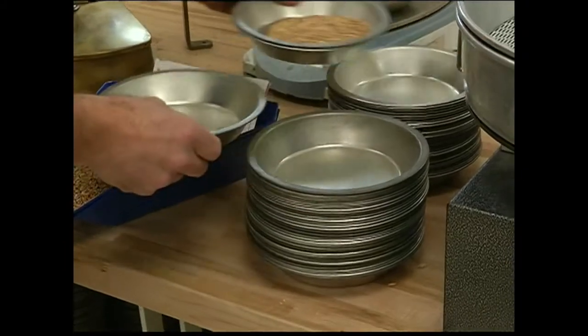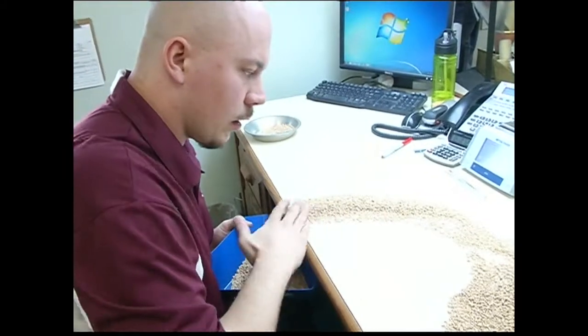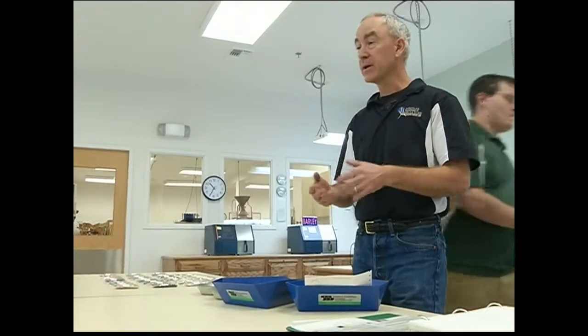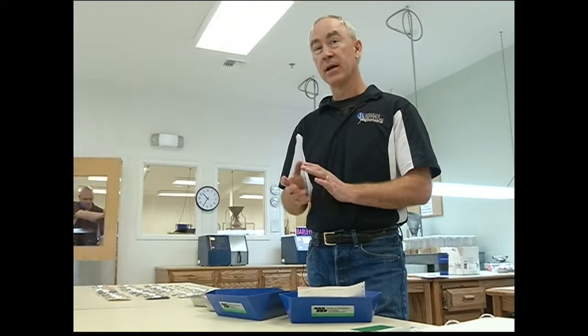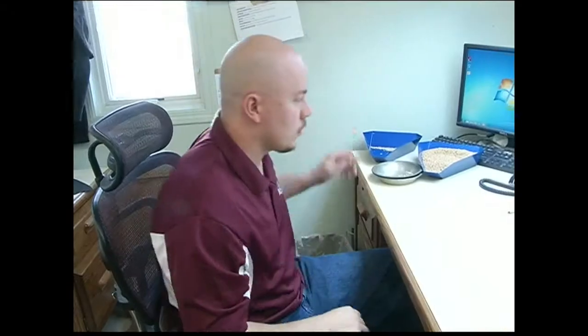Once the mechanical factors of wheat, such as moisture content, dockage, and test weight, have been analyzed, it then comes under the watchful eye of the inspector. All of our inspectors are trained by us, but licensed by the federal government. It takes about a year's worth of study and training to become a wheat inspector. And it's not a trivial effort also. The federal government comes into our lab and analyzes the work that inspector does and grants them a license. And that test to get the license might take up to 5 days of analysis.